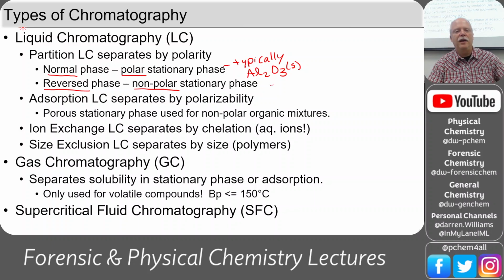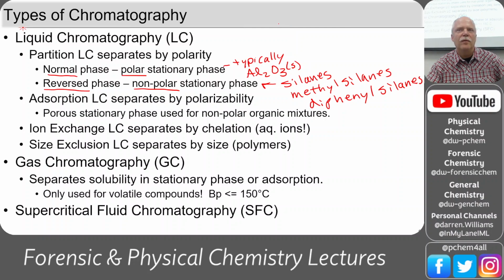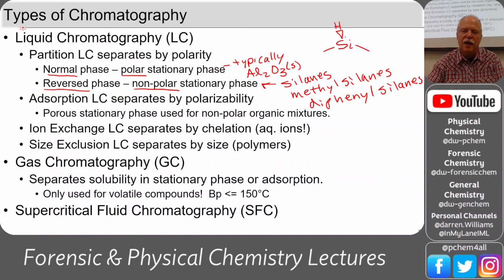We also want a very non-reactive surface. We don't want this to react with our substances, and so a lot of times those are silanes or siloxanes or phenylsilanes. So silanes, methyl silanes, and diphenyl silanes. Now, what in the heck is a silane? Well, if you look up here, carbon is in group 4. Right below it is silicon. And so that's what we're talking about. And so it would be the same kind of thing that you would see with carbon with CH2s, but you have SiH2s.